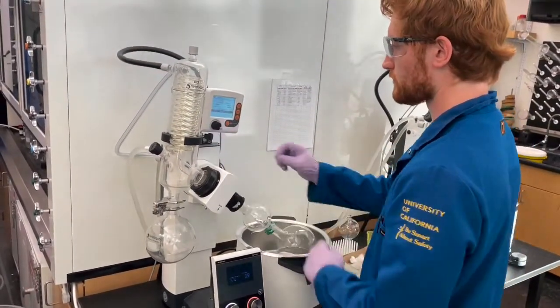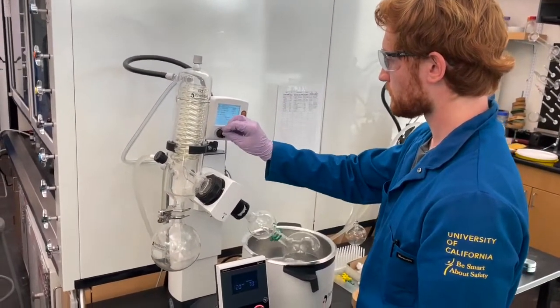The test tubes containing the amide product are combined and evaporated using this Rotovap instrument, which efficiently removes the solvent used in the column.